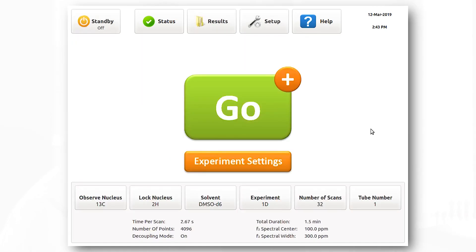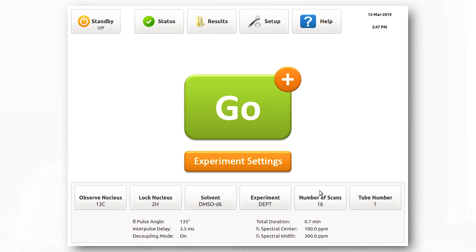Now let's see how we can run a DEPT experiment with the NMR spectrometer. Running this experiment is very similar to the 1D carbon we just ran. We will use DEP 4 molar again because we already know the sensitivity and the number of carbon signals we should see in the spectrometer. To run a DEPT experiment, the nucleus remains the same. The only thing that we need to change is the experiment from carbon 1D to DEPT.